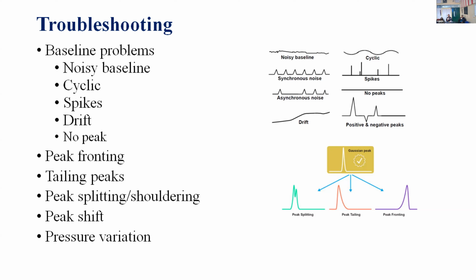For these we can check the column life, do proper washing, and purge the system better. And the last problem we sometimes face is fluctuation in pressure. Pressure fluctuation is directly related to the performance of the pump or a condition of choking or the condition of the column. So these are the basic troubles, and these can be sorted out. Thank you.